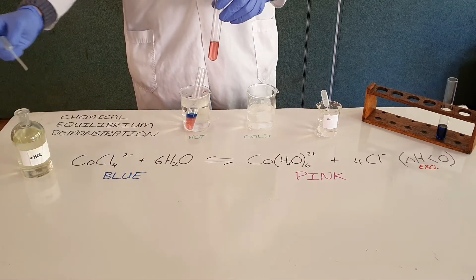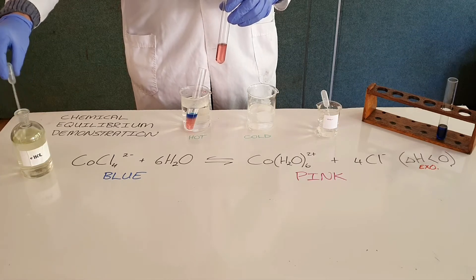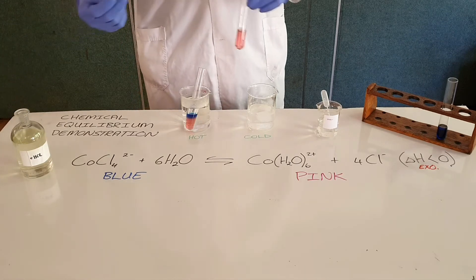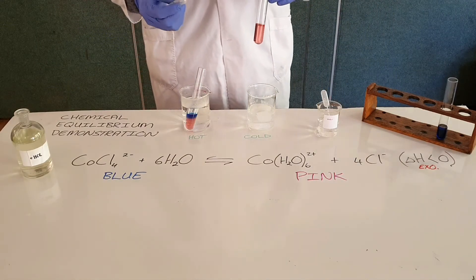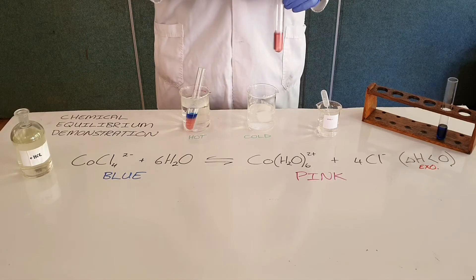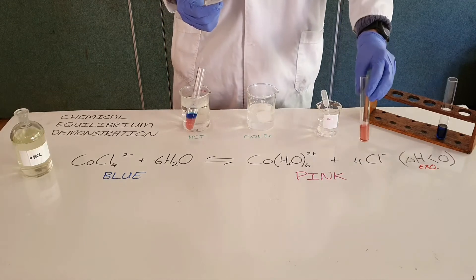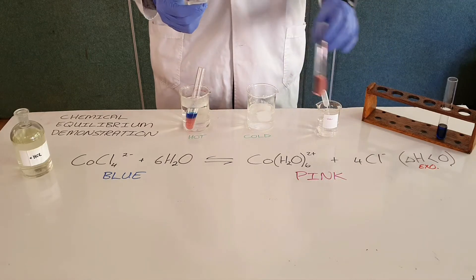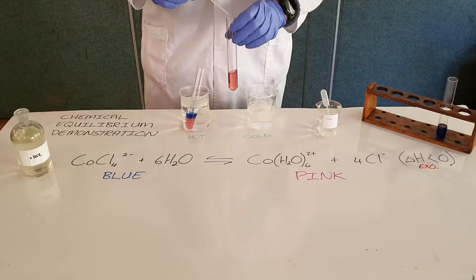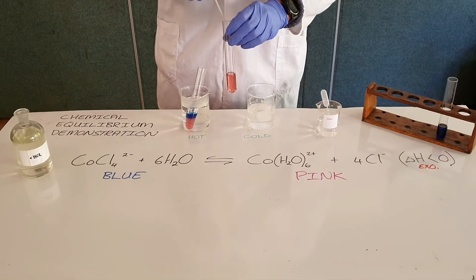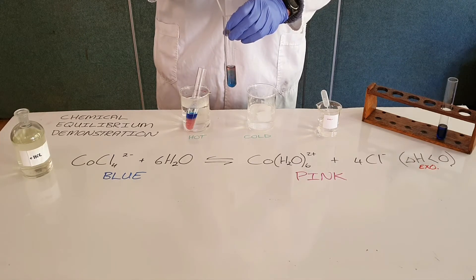Now I'm going to demonstrate that by increasing the concentration of one of the products — in this case, chlorine ions. We know that hydrochloric acid, when it ionizes, forms hydrogen ions and chlorine ions. So by adding hydrochloric acid to the solution, I am adding a common ion — which is why this is called the common ion effect. That increases the concentration of one of the products, which means we should favor the reverse reaction. And we can see the solution turning more blue.